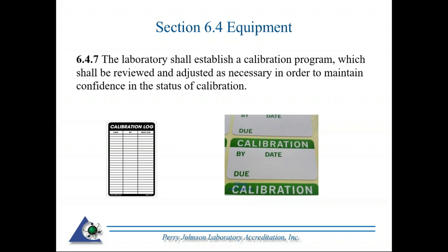If you send them out every year and you're looking at them and you're seeing some drift, it's getting closer and closer to drifting out of tolerance, then you may want to shorten that calibration interval. If you're spending a lot of money having it calibrated every 6 months, or every year, and you have some history behind the item and you're seeing it's pretty rock solid, it hasn't drifted or had any noticeable changes within calibrations, then that might be criteria for increasing the calibration interval.